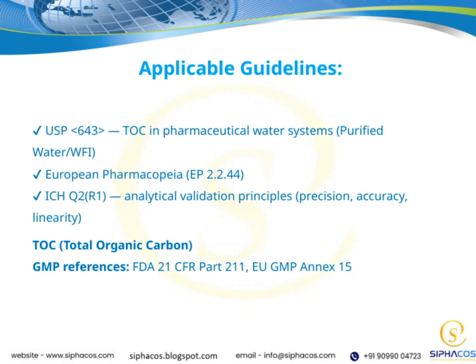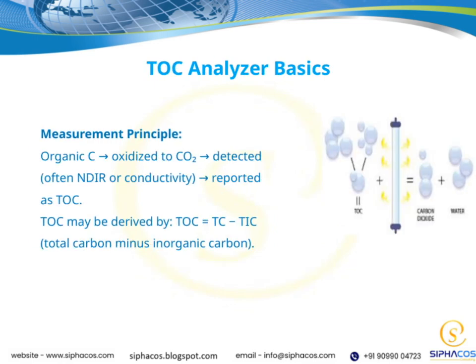These regulations reinforce the importance of validation and control in pharmaceutical manufacturing, including water systems. Overall, these guidelines form the foundation of our quality assurance practices, ensuring that we maintain high standards and consistency in our processes.